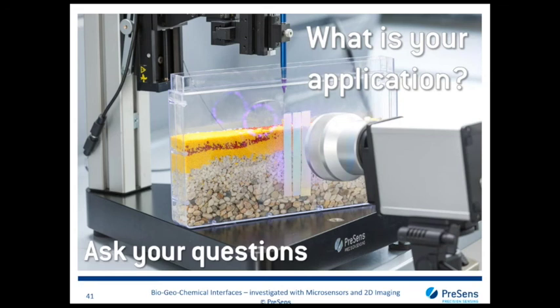Okay, there's another question on possible light interferences with photosynthetic organisms. And this is related to the imaging sensors. The imaging sensors contain an optical isolation, which is on the sample side of the sensor foil, and this blocks the excitation light from getting towards your sample. What you can in principle do is, for example, for the oxygen sensors, just peel off the optical isolation, then the sensors get more transparent and you will see more underlying structures, or you keep it on and then your sample is protected.